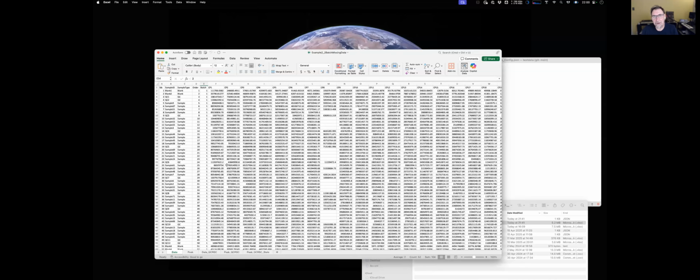But if you've got a very long batch, say a batch of 200 injections, and you've got a QC every 20th sample, then you might find that there's quite a lot of nonlinear drift, but the model's not fitting too well because there's not enough data points to fit on. So it's an interplay with the data that you've got. Use the software, see how it works, and then moving forward when you design new studies, if it looks like you've got a lot of nonlinearity in your system, then think about injecting more QCs so that you can get a better fit. It really does go hand in hand.